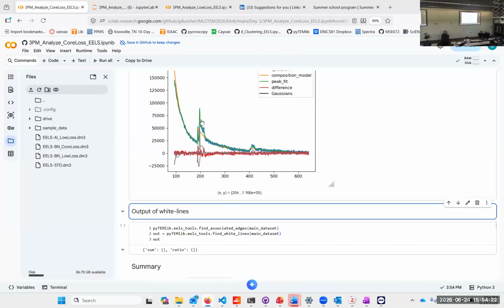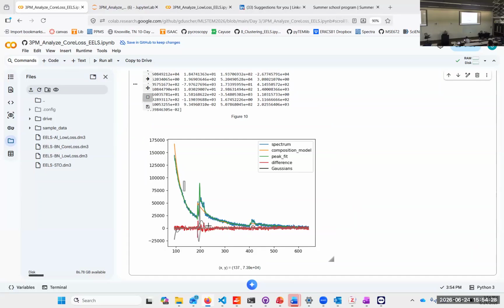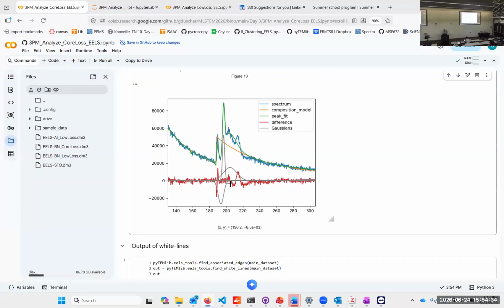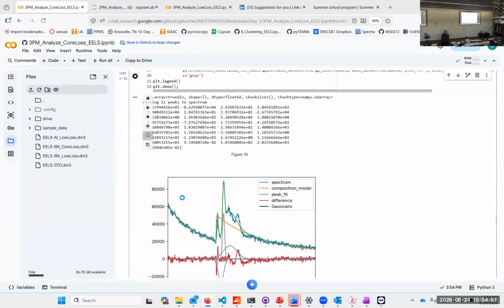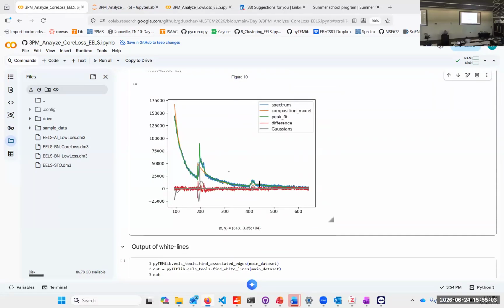We can't redo that. Where is my, here. So we did a large area here. You see we have just a few Gaussians here in that one. So if you run that in a few iterations, then the large peaks that are missing, you can still add here. Where is my spectrum? I want to go back. Okay. And so let's look at this part here.